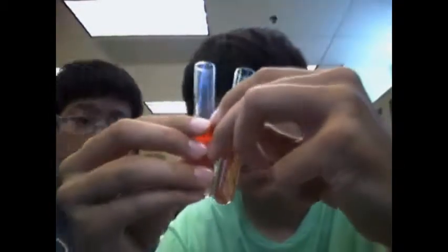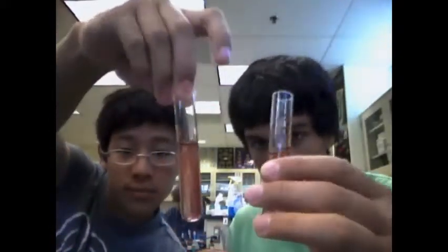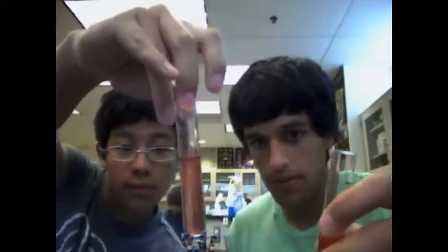Going with unknown substance number 1. You can see it looks like the water. Very similar. We don't see any levels of fat.